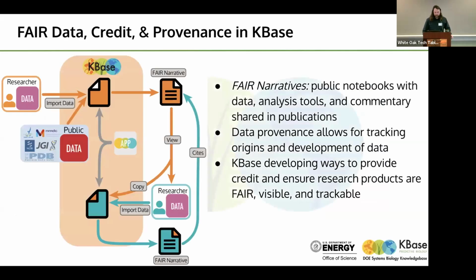So part of the vision of KBase is this sort of social feature where people are putting their data out there into the world, and other researchers are finding that data in the publications or on the system and doing their own unique analysis. So this graphic just shows the example of two different researchers sharing their narratives with each other and analyzing it in the context of public data. I'll also show you some of the ways that KBase is incorporating large data sets from different groups.